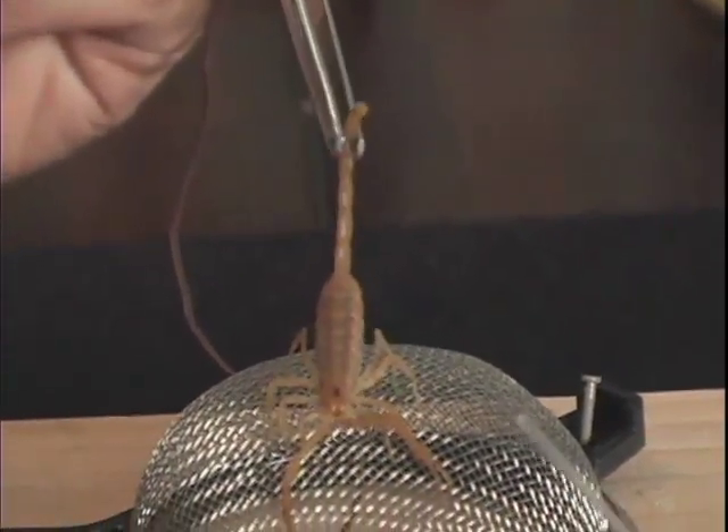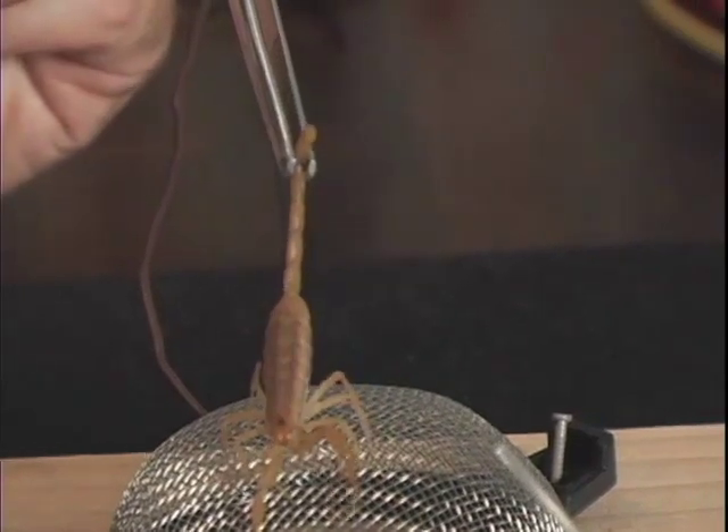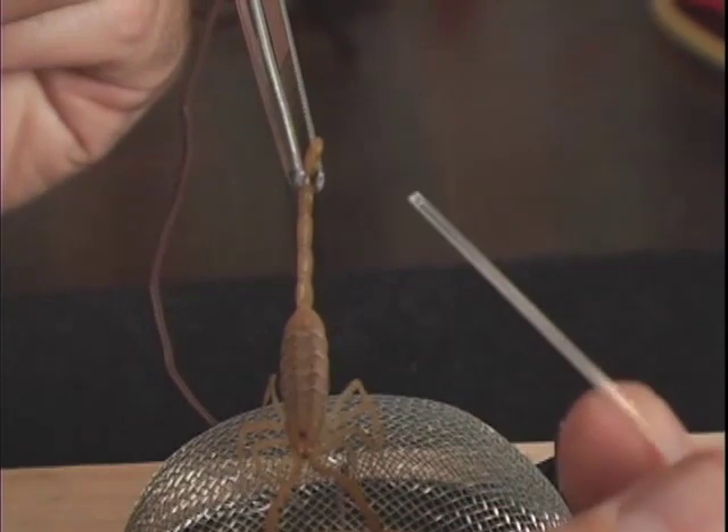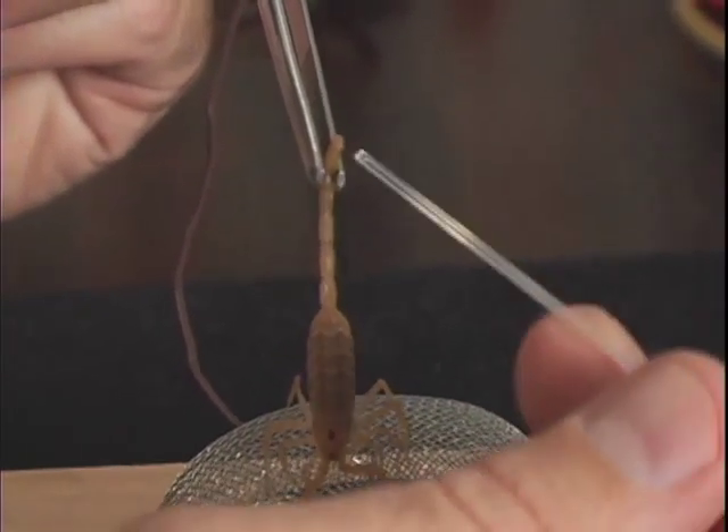By the way, the forceps don't hurt the scorpion — its exoskeleton is very tough. A scorpion releases only a tiny amount of venom at a time. It doesn't need to release more because the venom works so well on its prey.